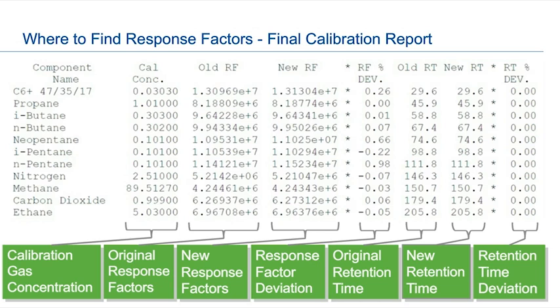A couple of other ones. Do you plan to go over forced calibration, and when is it necessary to perform them? We're actually not going to go over that. Again, we have a topic on June 12th where we talk about calibrating your GC, and that's a good one where we'll talk about when it is okay to do the forced cal. Generally I will tell you, don't do it unless you know why you're doing it. There are times when it's acceptable, but you have to understand what you're doing when you do it.